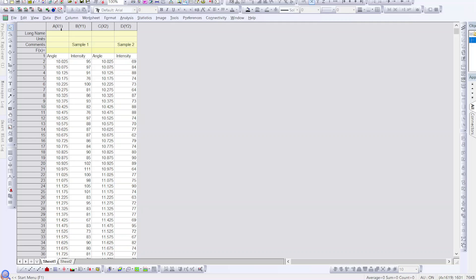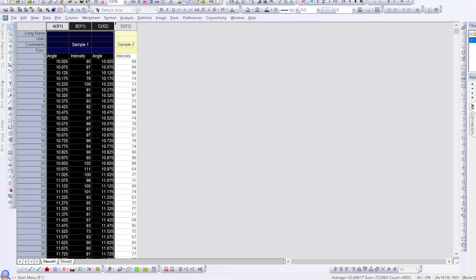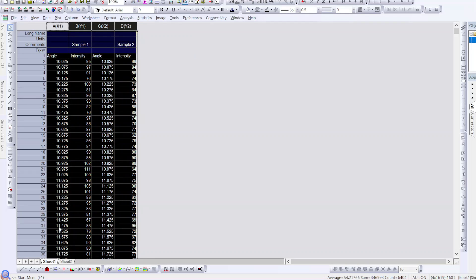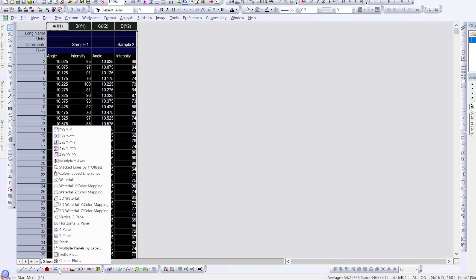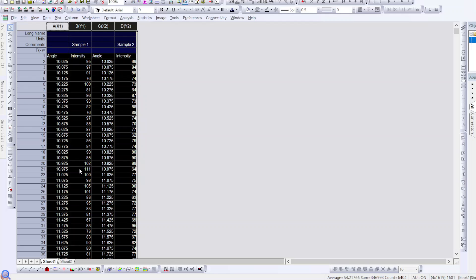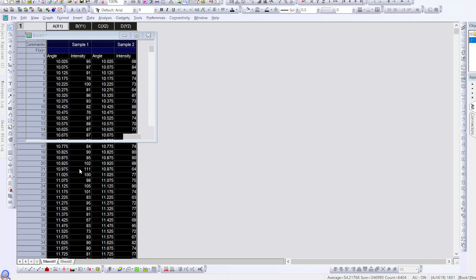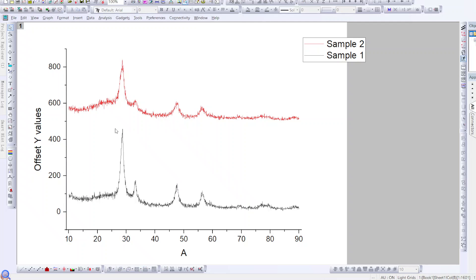There are two simple ways to plot this data and I'll show you both one by one. First, select all the data, then click the graph icon. For the first method, choose 'Plot as Stacked Lines by Y-axis' and click on it — your data will appear in this form.